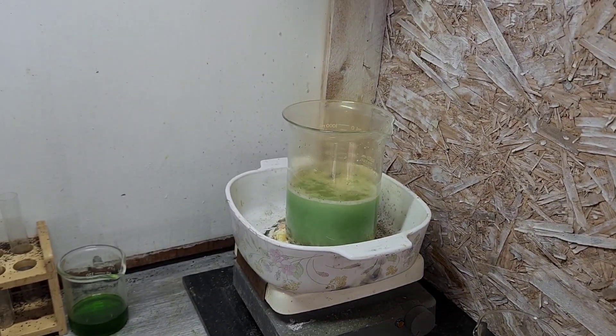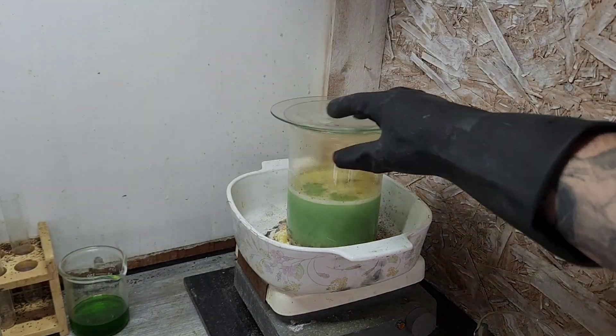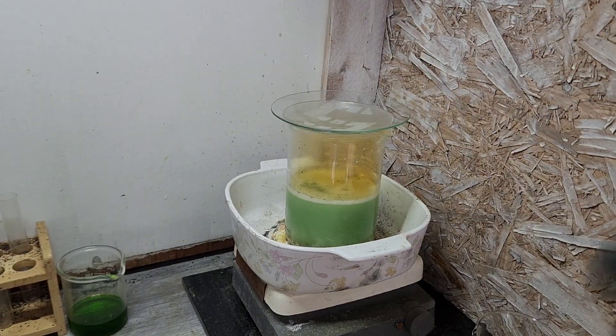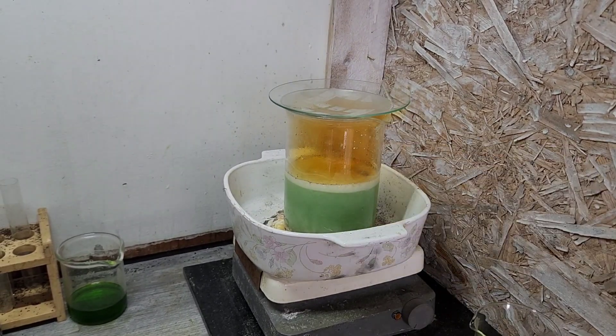There we go. Let's get a lid on that so we can retain those fumes. Those will condense on the top and drip back in as nitric acid. Alright, that works pretty good.